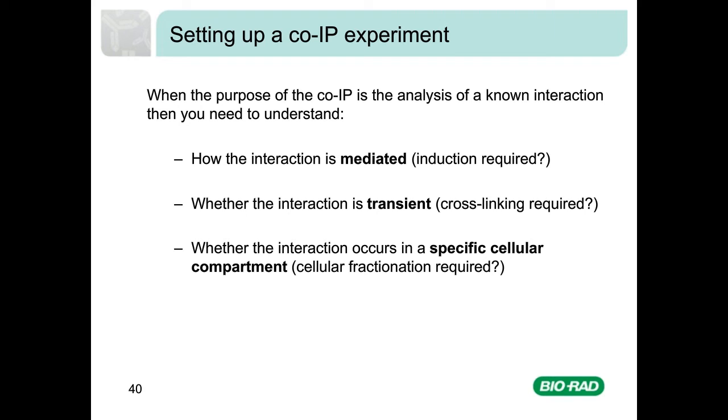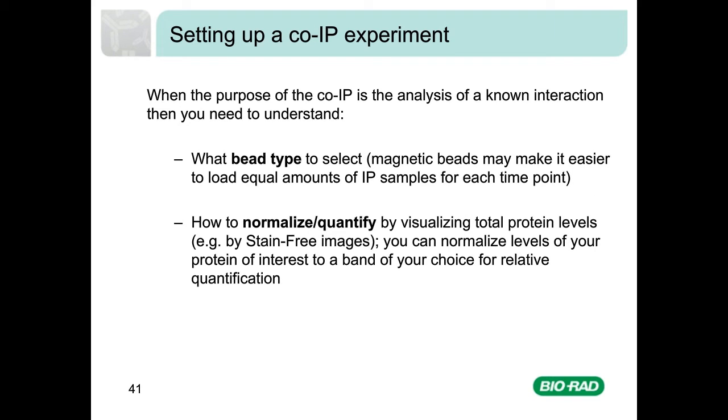Additionally, it is important to carefully select what bead type to use for the co-IP. The advantage of reduced sample loss with magnetic beads may make it easier to load equal amounts of IP sample from each treatment or condition when using this bead type.